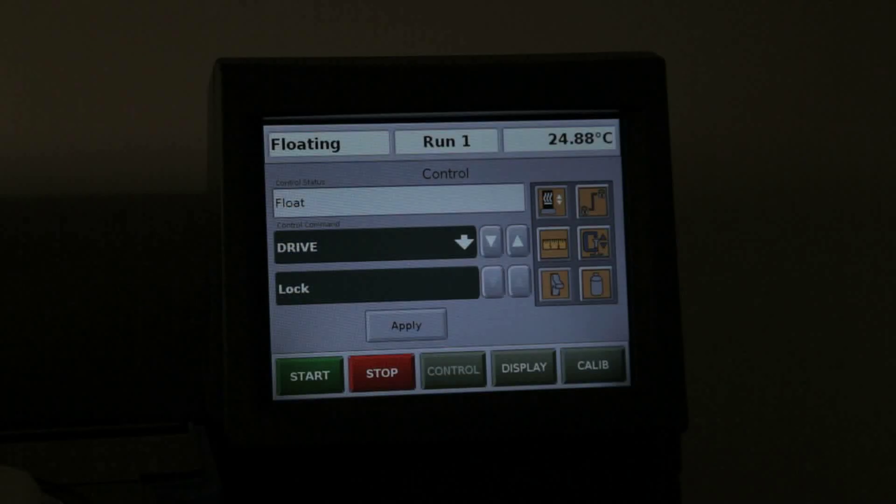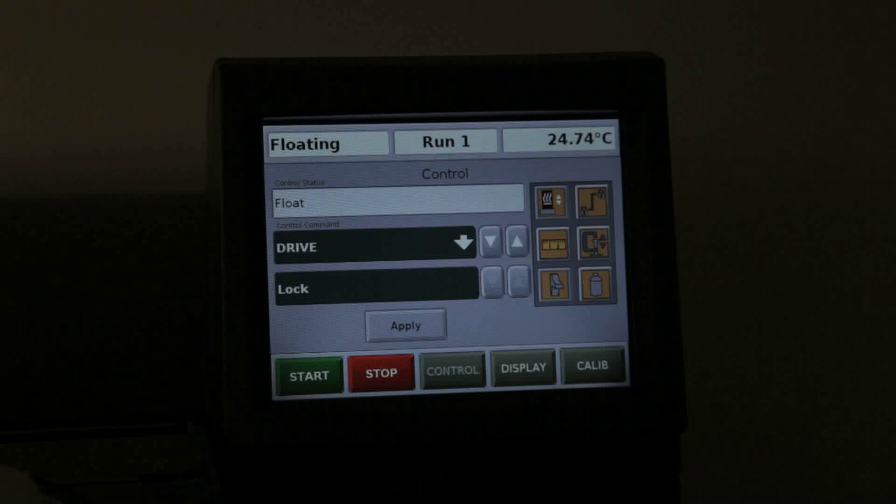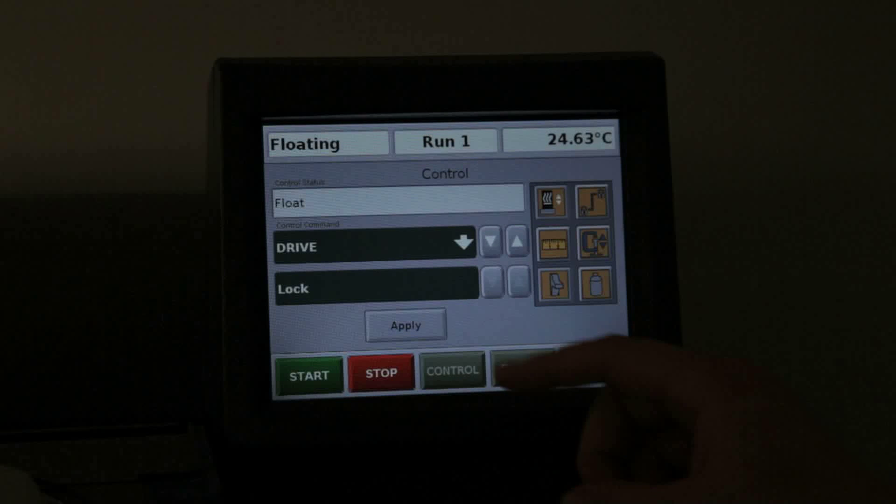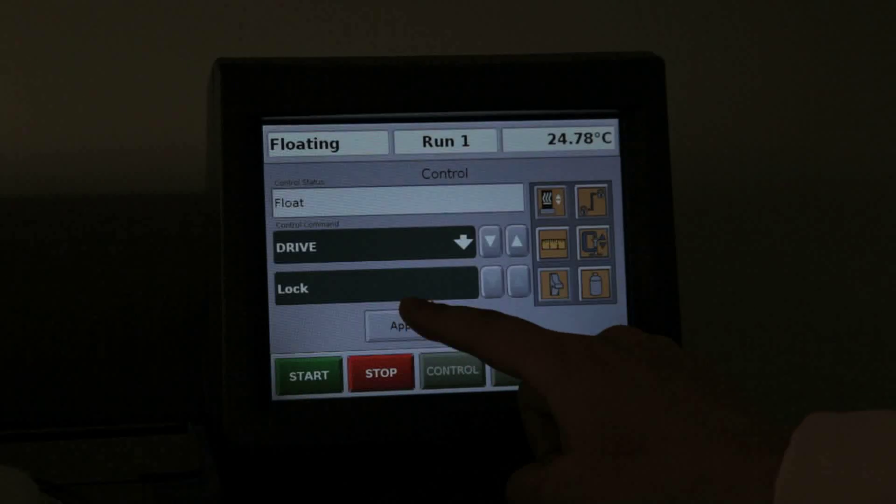Before calibration, we shall first install the clamp to the instrument. From the touch screen, lock the drive shaft.